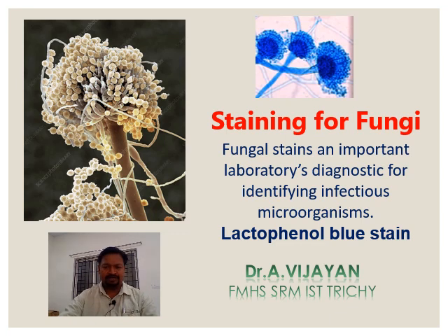Fungal stain is an important laboratory diagnostic method for identifying the infectious microorganism using lactophenol blue stain. For example, fungi are equivalent to mushrooms. Fungi are eukaryotic organisms that are classified into two broad groups: one is yeast, another one is mold.